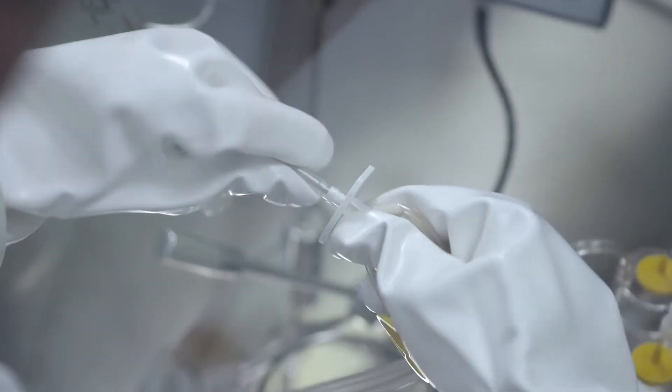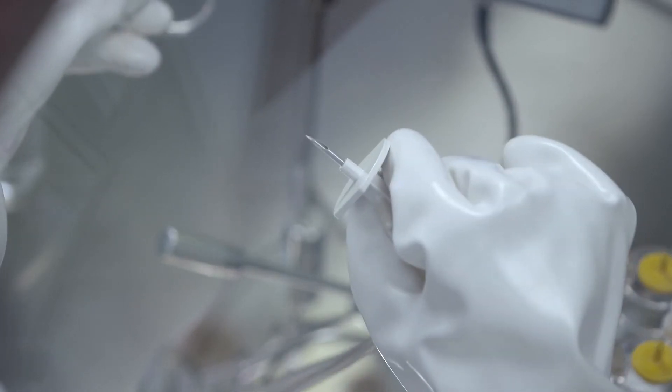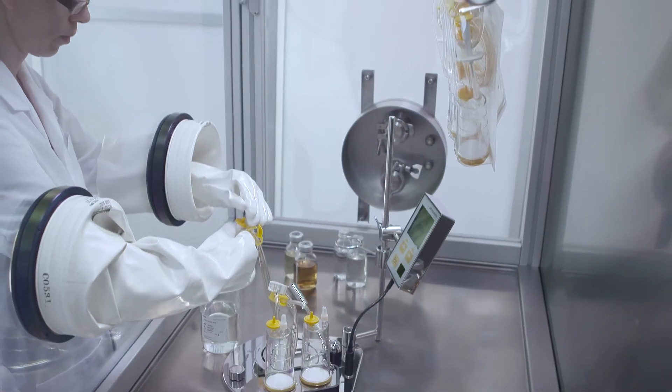A dual-needle metal spike for simultaneous pumping of liquid and for sterile aeration.